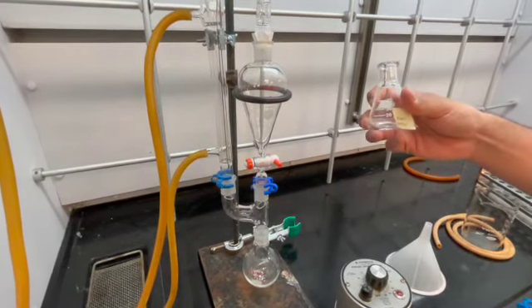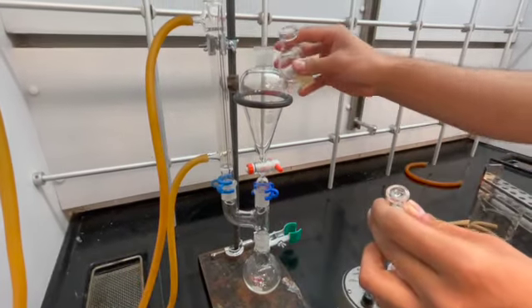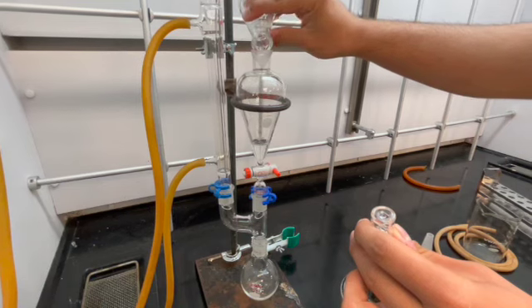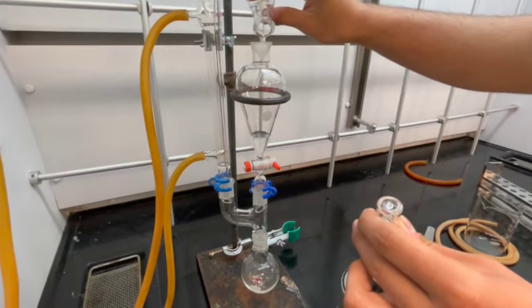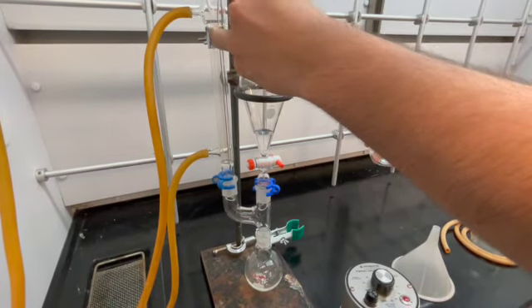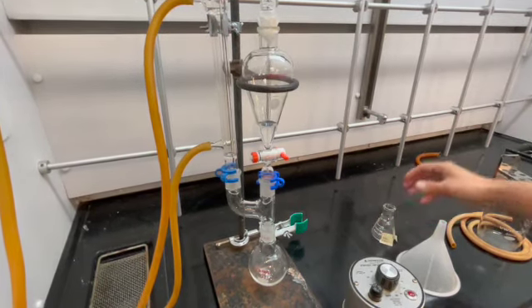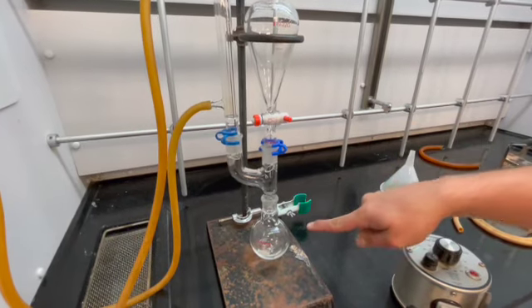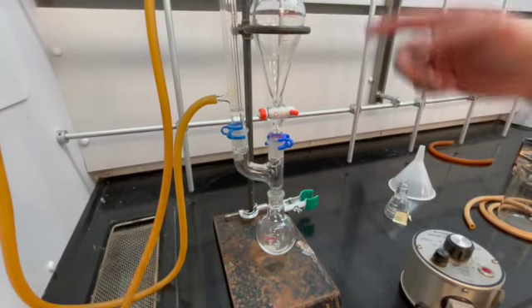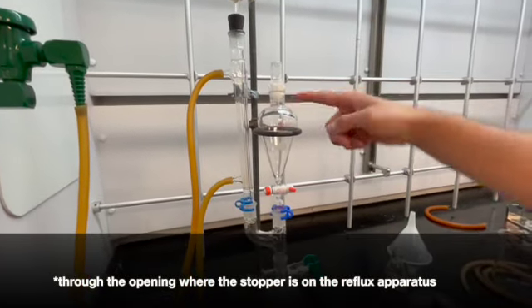We will grab five milliliters of diethyl ether and place it through the reflux. Once we do the whole process, we have to let this sit and wait till it clouds up and bubbles a little bit. Then we will add another 6.5 milliliters through the reflux and let it drip in.